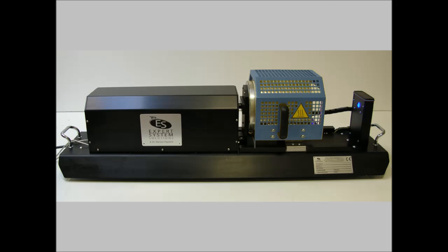Welcome to this brief presentation of the new heating microscope MISURA HSML. Expert System Solutions developed this instrument for all the applications which do not require high heating rate or very high temperatures. This heating microscope is available with two furnaces to reach 1200 or 1400 degrees centigrade with a heating rate of 30 degrees per minute.